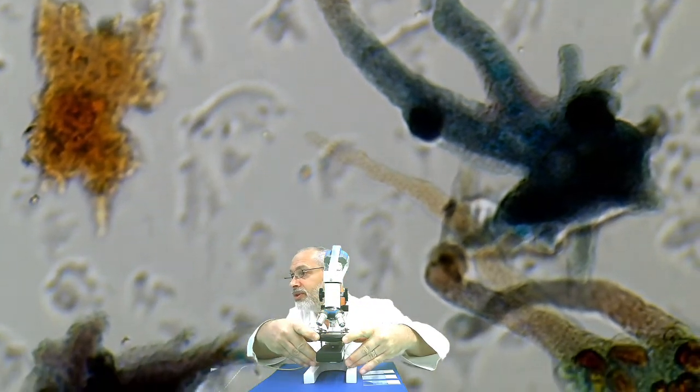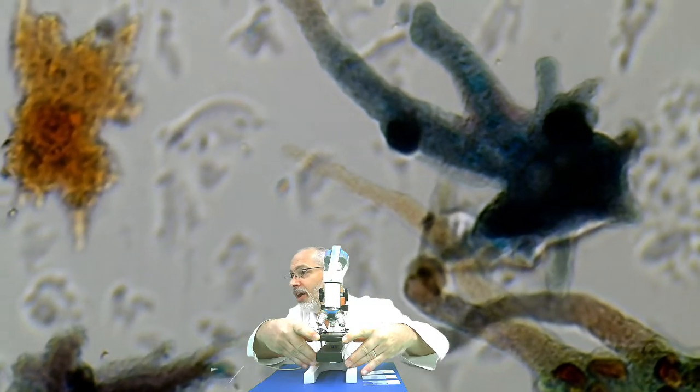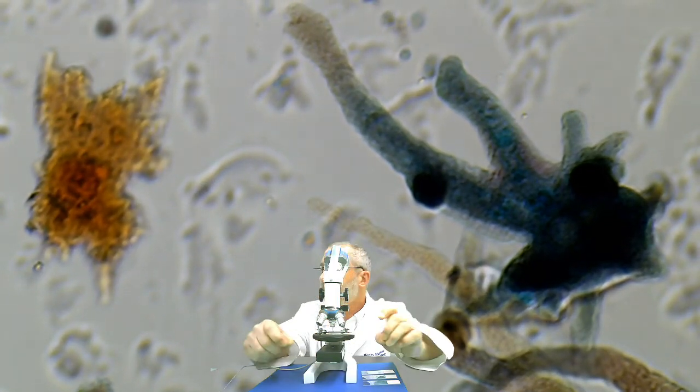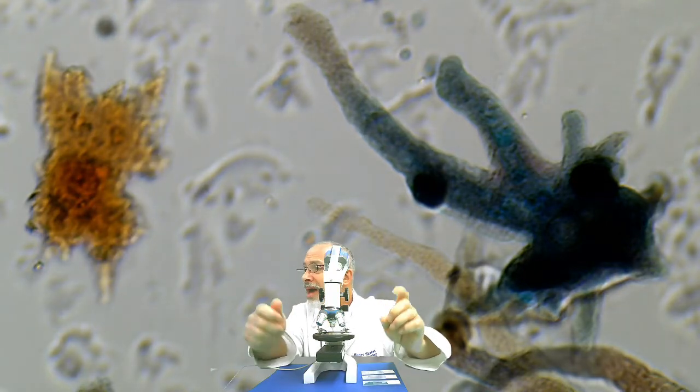So this looks like a nice little collection of amoeba. And so what I'd like you to do is start drawing these. Again, this is the amoeba under 40 times magnification.